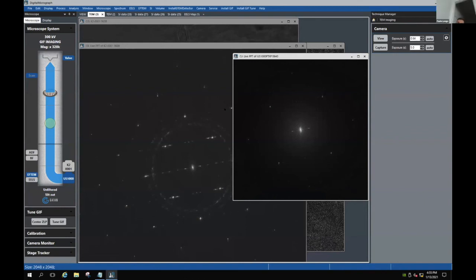Yeah. Okay. I think we understand there'll be a lot of effort to try to find a good particle, but if we could practice setting up the right conditions and making sure that we understand how to use the camera in that way, I think that would be very beneficial.